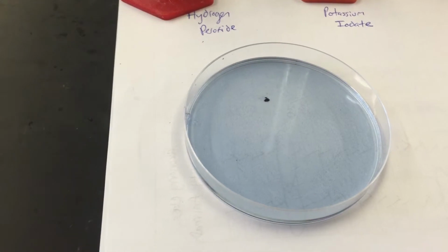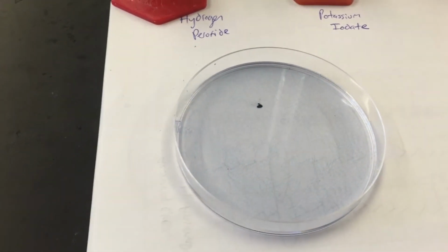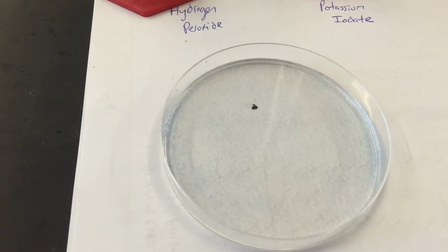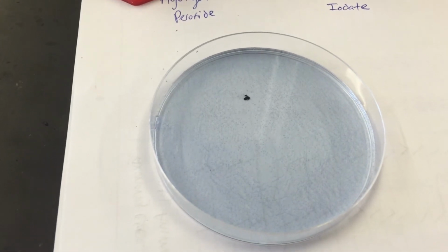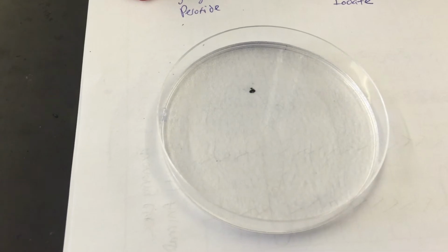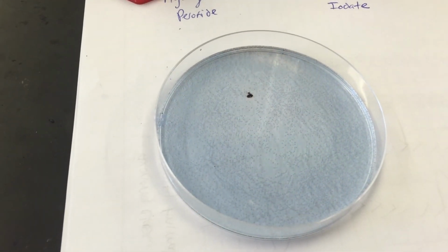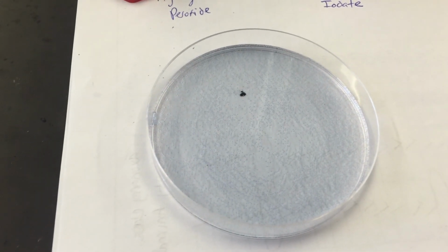Back to being blue. This is called an oscillating reaction, and it will keep oscillating like this for about 10 minutes or so. Obviously, I'm not going to keep this running for about 10 minutes, but it has to do with equilibria to some degree. So just think about that. What possibly could be the cause of this oscillating reaction? That's the Briggs-Rauscher reaction.